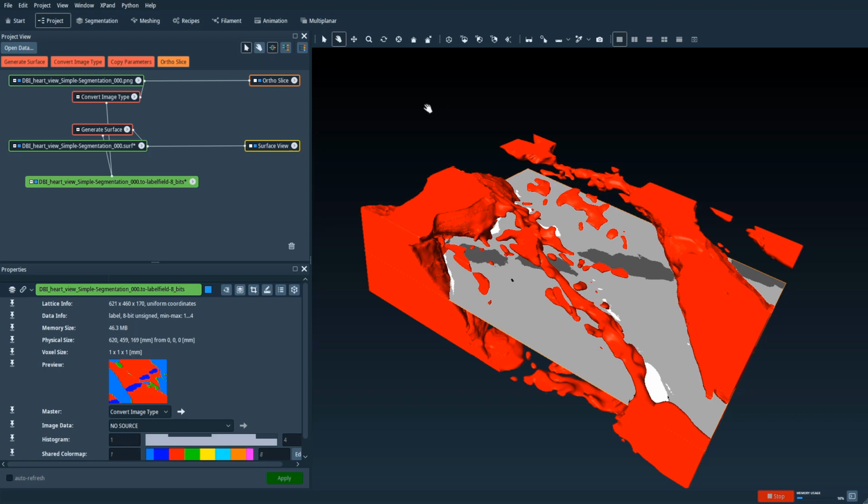So these two tools can be quite powerful, and once you've gained an intuition on the more important tools and features in these two applications, then I would say you would be well equipped to perform segmentation on a wide variety of data sets.